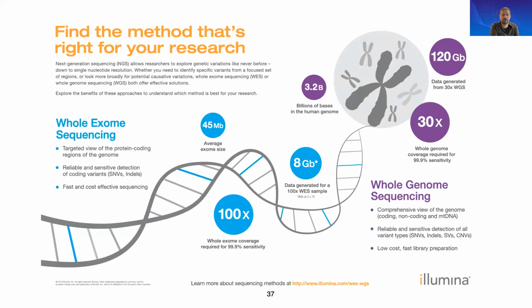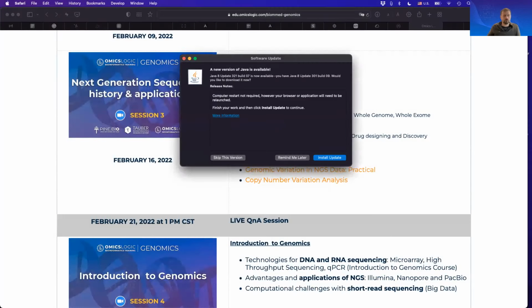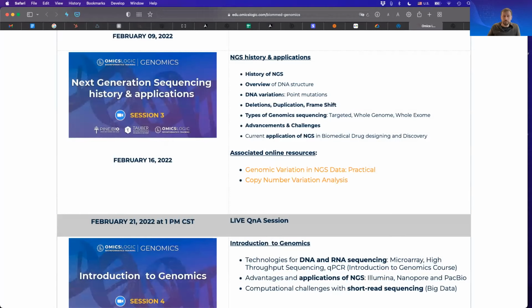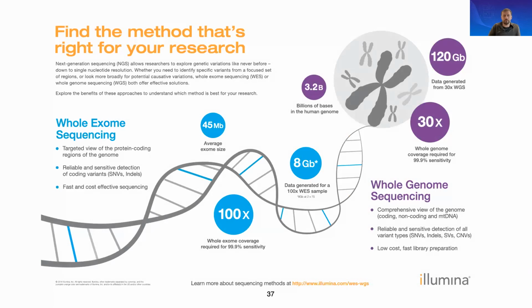So that doesn't have a lot of data to work with per each position. But the number of nucleotides is going to be huge. If you think of the human genome, which is about 3.2 billion nucleotides, that is going to give you 3.2 billion positions with 5 reads, where you can measure what types of variants you are finding.